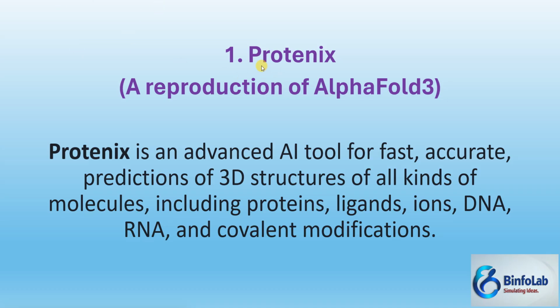So the program name is Protenix, and it's actually a trainable reproduction of AlphaFold 3. There was a limitation in AlphaFold 3 that you can only dock a certain number of ions or a certain number of organic molecules.